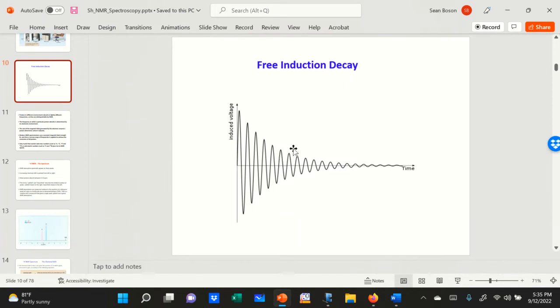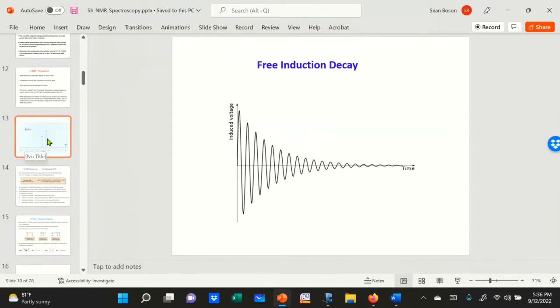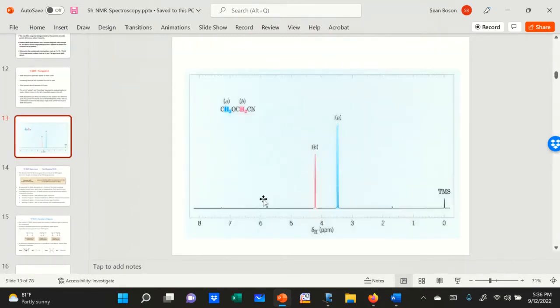Filtered is the term. Sounds funny. Filtration you have to learn in lab, you filter with filter paper. How do you filter a signal? Well, this electronic information, also called time domain information, is filtered through a highly advanced mathematical equation called Fourier transformation. That Fourier transformation, mathematically done in this machine, eventually transforms into the same NMR spectrum that you understand without such technical weirdness, so to speak.